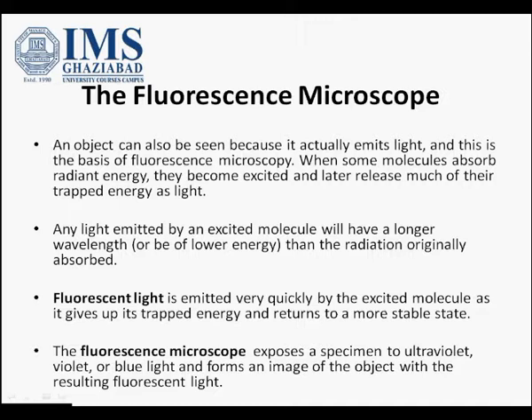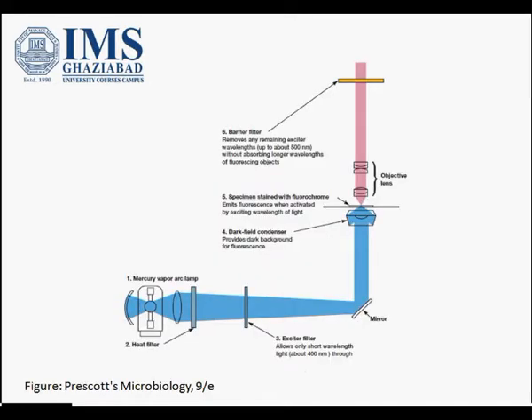So this is the basic concept of fluorescence microscopy, which exposes the specimen to ultraviolet light or blue light and forms an image of the object with the resulting fluorescent light. This is a ray figure of fluorescence microscopy.